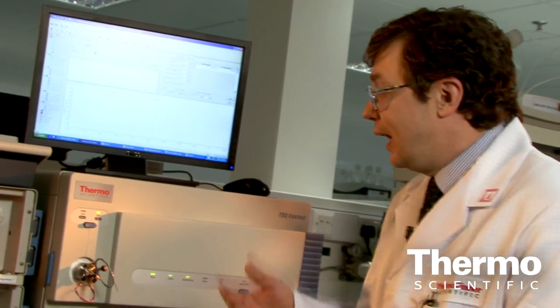And this is the latest mass spectrometer from Thermo Fisher Scientific. What this allows us to do is really start to analyze very low sample volumes, which in the field of clinical analysis and also pharmaceutical analysis is really critical. Because what it allows us to do is actually take smaller sample volumes.